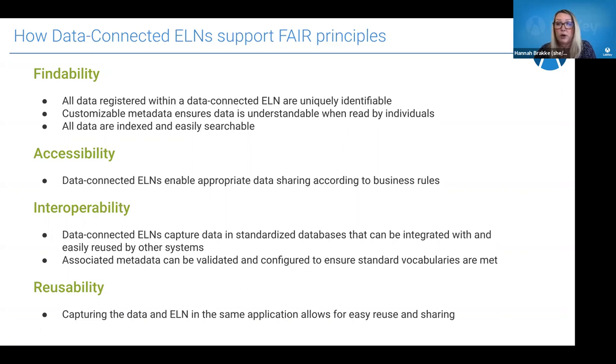Accessibility: making sure that the data connected ELN enables appropriate data sharing and access according to the business rules, again, of your organization. Interoperability: making sure that the data is being captured in a standardized database that can be integrated and used by other systems. This could mean you're pushing that data out to somewhere else, or potentially even pulling other data into that system as well. And again, we continue to talk about this, but having that really rich associated metadata.